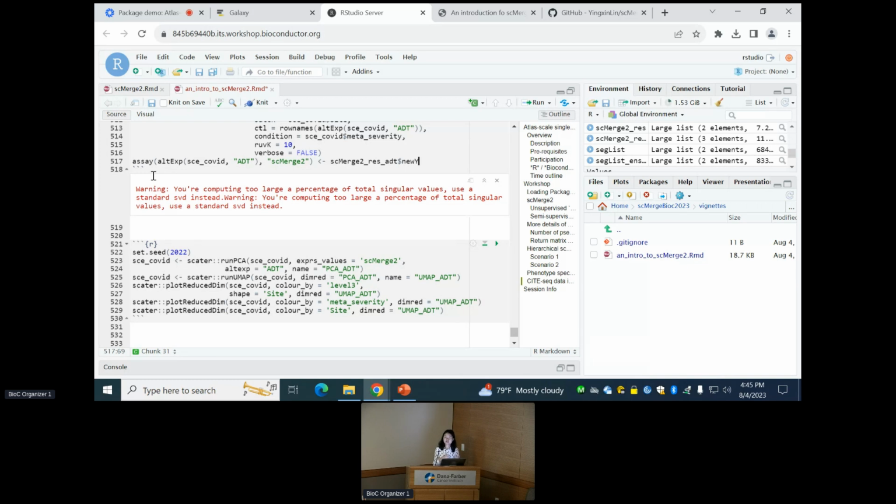But you have a different number of histones if you're in G1 or G2, right? Maybe that's why. It could be a cell cycle thing, but as long as you're in bulk, the cell cycle effect is not an issue, so maybe it's only good for bulk. That's just a guess, I have no evidence for that. Yeah, I need to go back to check that dataset. It could be that they are all bimodal, so probably they have a higher variance. That's a pretty good explanation.